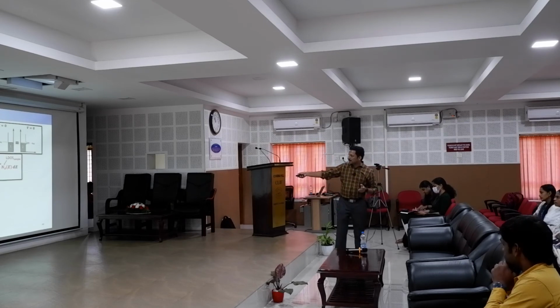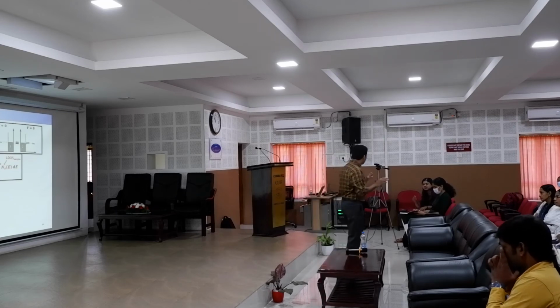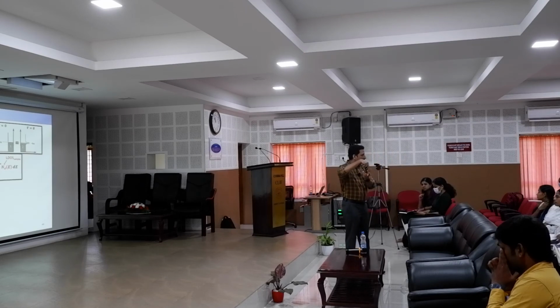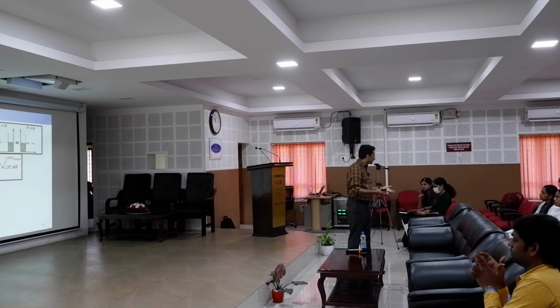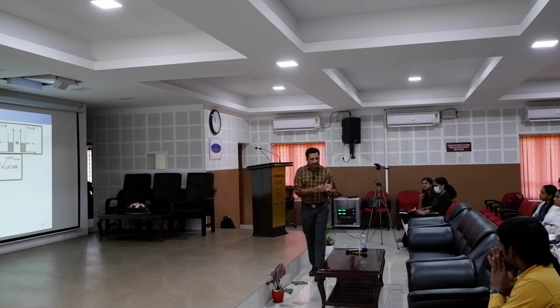So there should be states available, which actually means that I can measure the density of states of the material. How? Because how many states are available in my sample? The current which is passing from the tip to the sample will be proportional to the number of states available there, because metal has, theoretically, infinite number of electrons. So if a large number of electrons are going from the tip to the sample, this means that so many states are available there in the conduction band. If I am getting a large number of electrons from the sample to the tip, it means that a large density of states is there in the valence band.